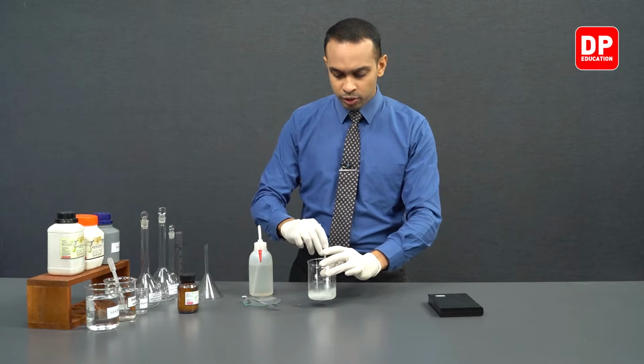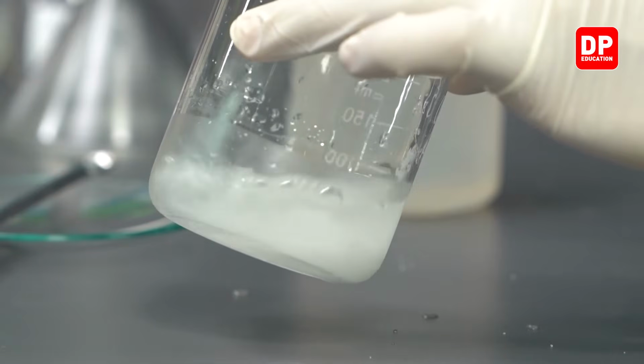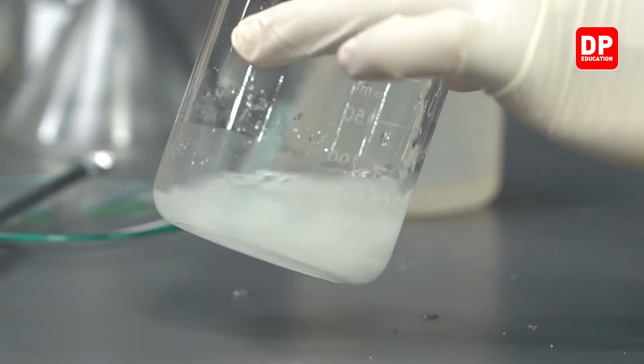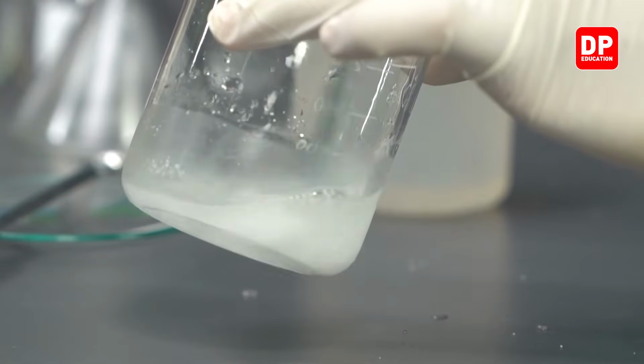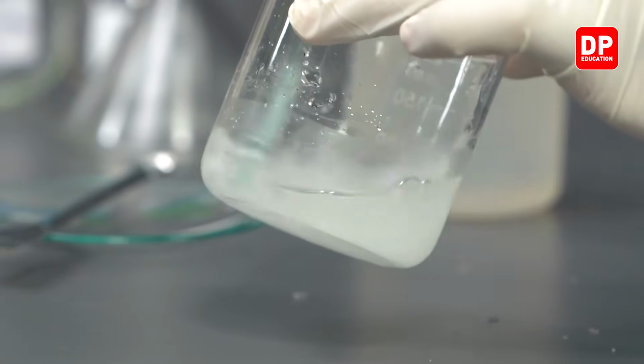Be mindful when you're adding water, because we are trying to prepare a 100 milliliter solution. If you add more than 100 milliliters of water here, then you will not be able to prepare 3 moles per decimeter cubed potassium iodide. Your concentration will be slightly different from what you want.